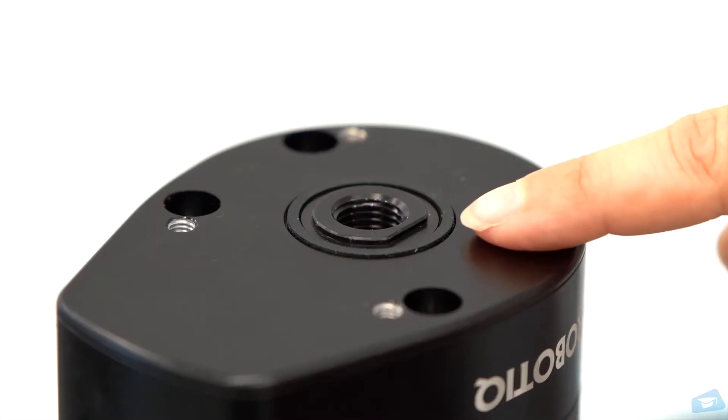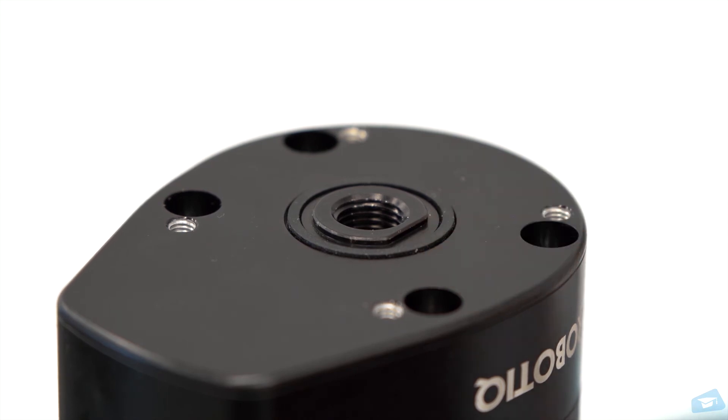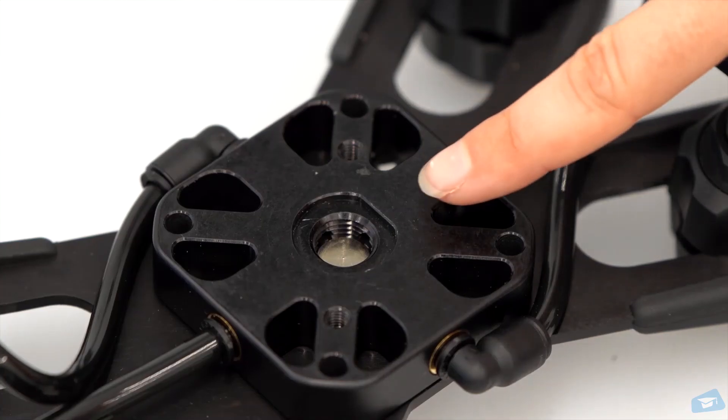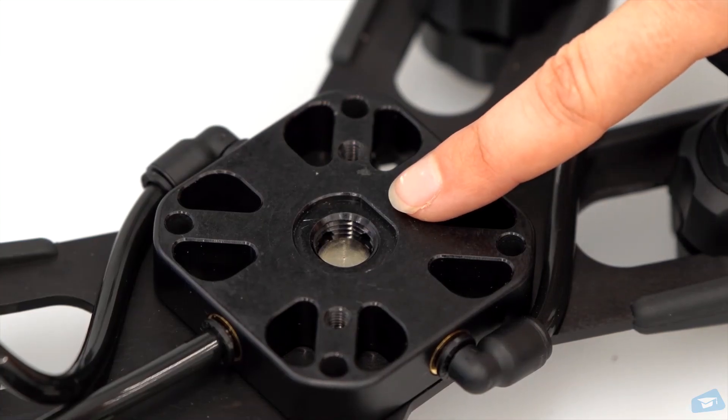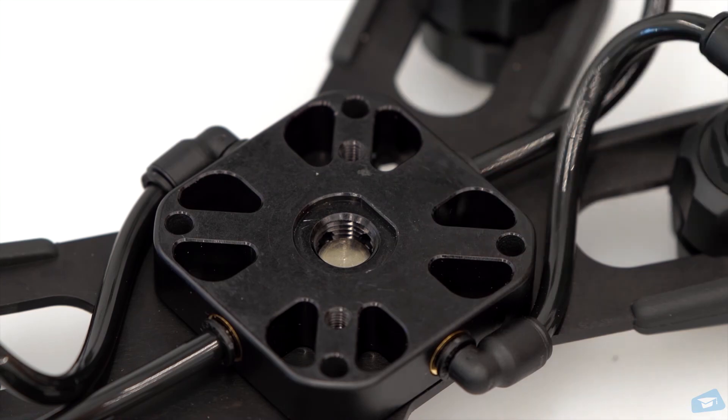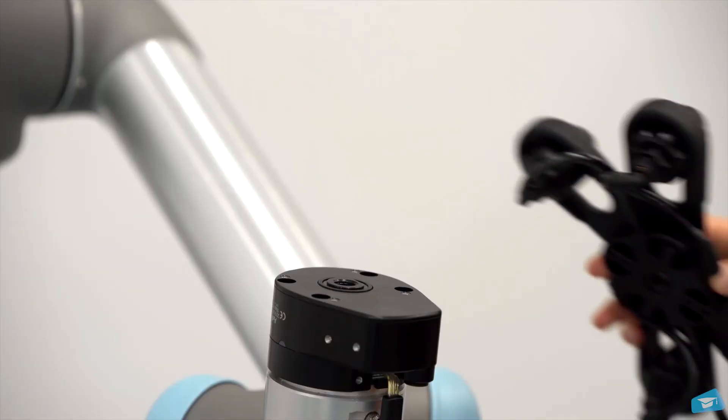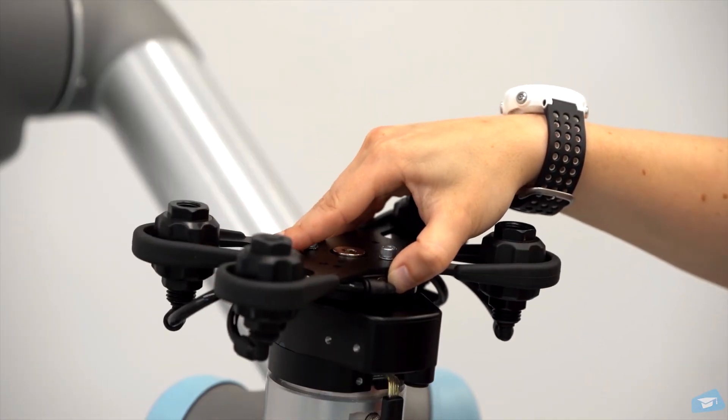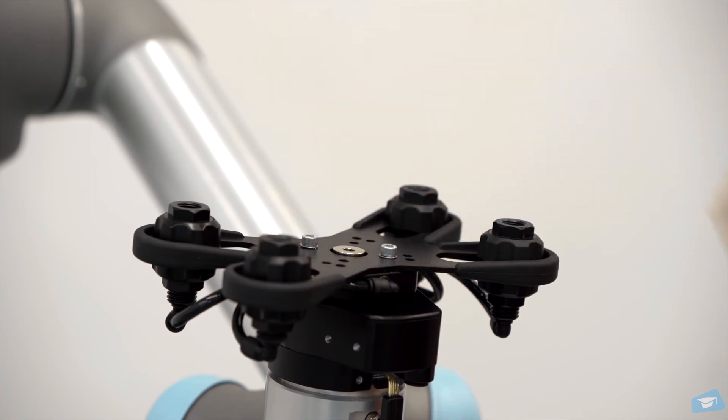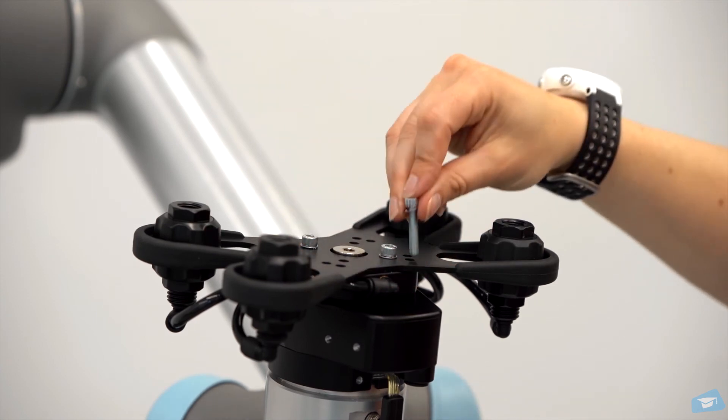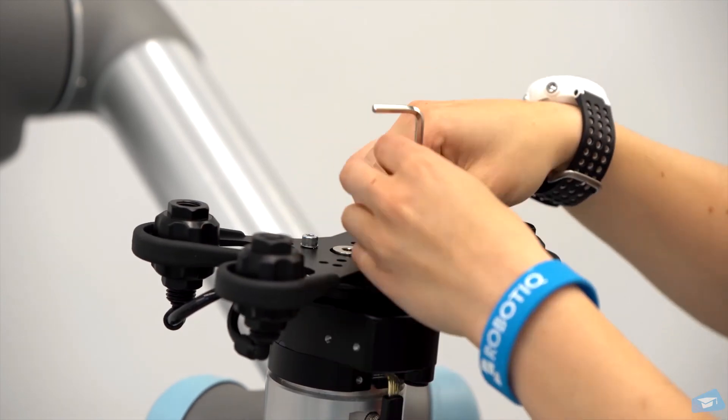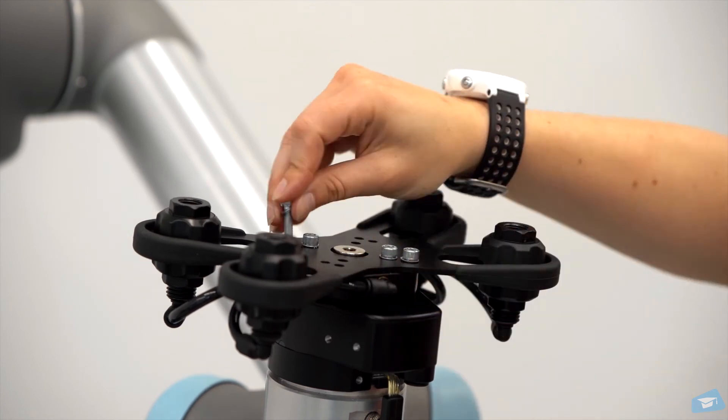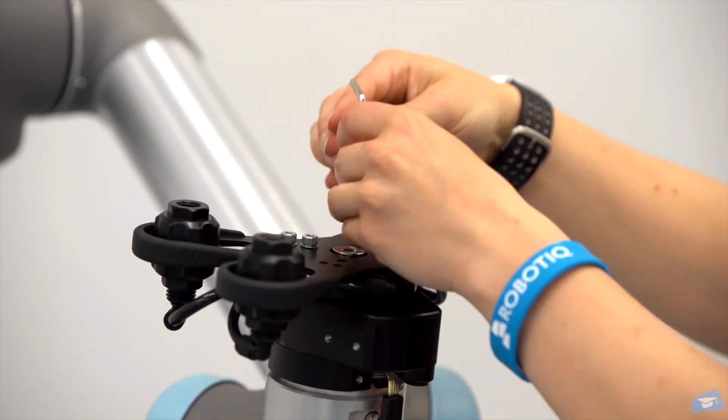Align the shoulder of the vacuum generator with the flat surface of the manifold. Then, mount the manifold assembly using M5 screws in a cross-pattern way to properly compress the O-ring of the vacuum generator.